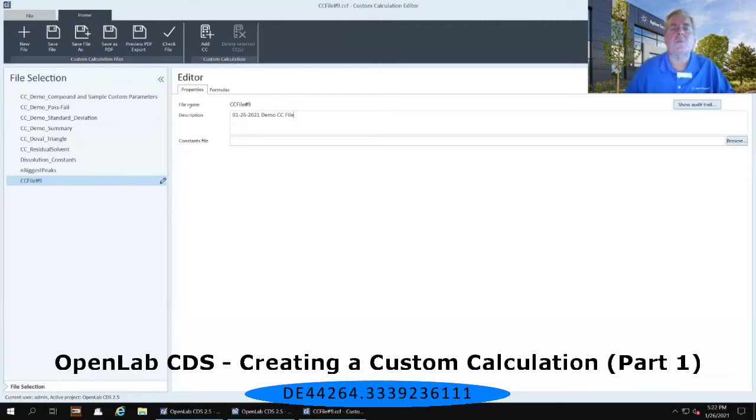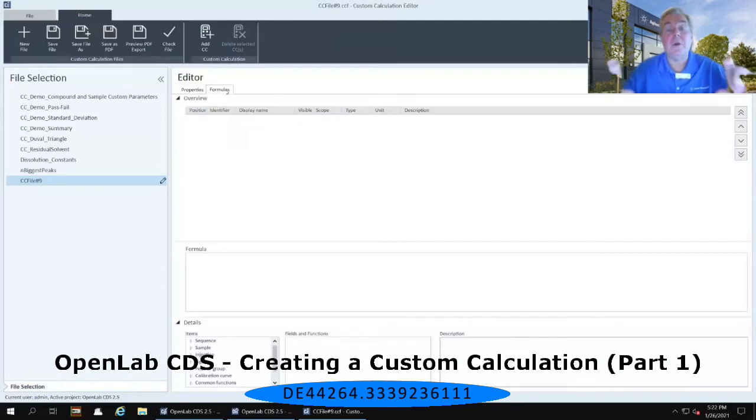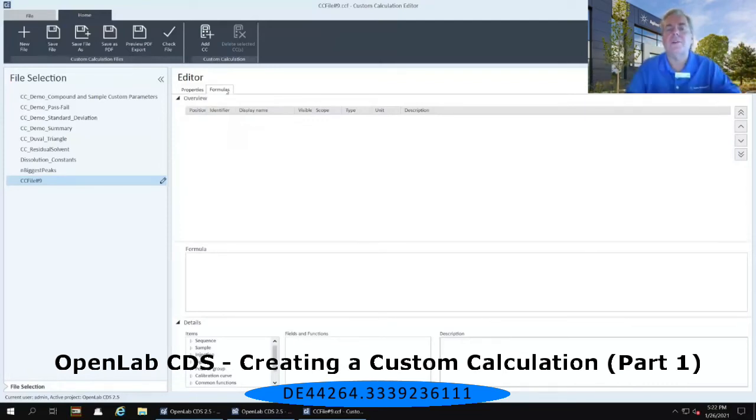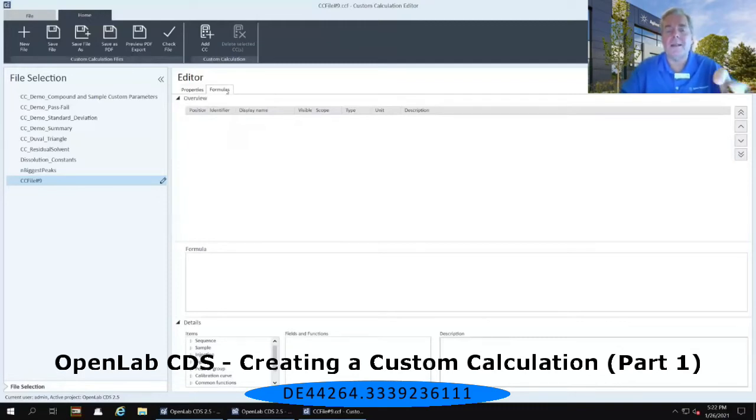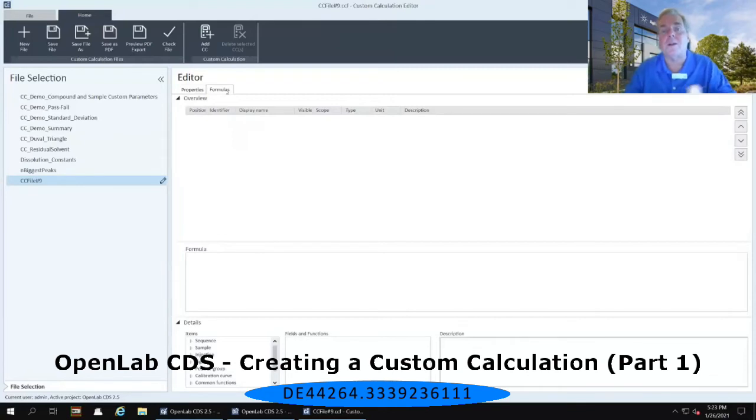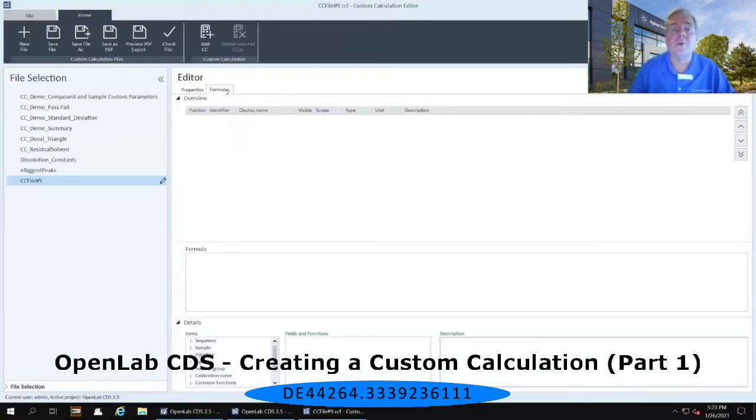Next, immediately to the right of the properties tab, there is a formulas tab. I want you to select that formulas tab. And in that formulas tab, we now have on the right-hand panel three separate windows. There is an overview window first. There is a formula window in the middle section. And then there's a details window down below that's actually subdivided into essentially three more windows or three columns in that lower window. We're going to go through all of these as we create our custom calculations.